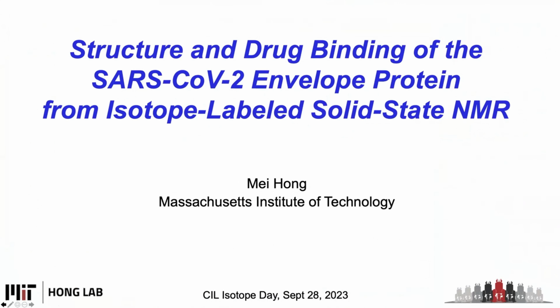Okay. So today I want to tell you about my group's recent work in using many diverse isotopic labeling patterns in solid-state NMR to determine the structure as well as the drug binding site of the SARS-CoV-2 envelope protein.